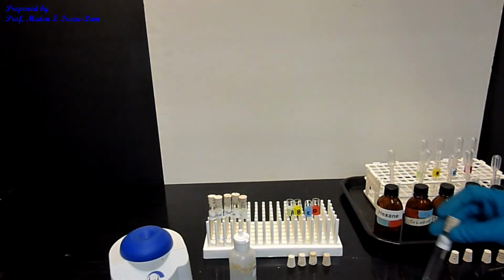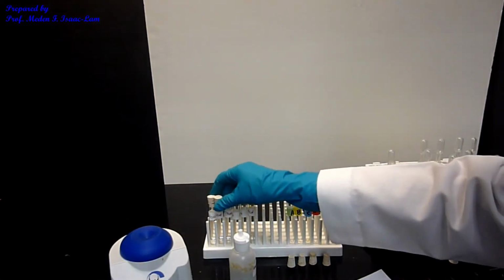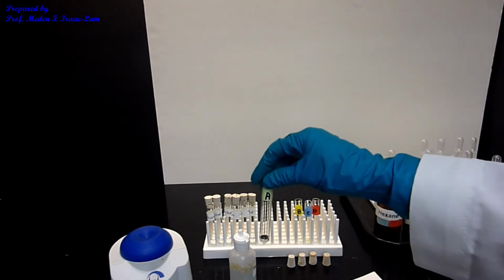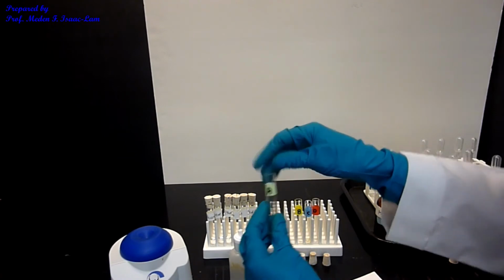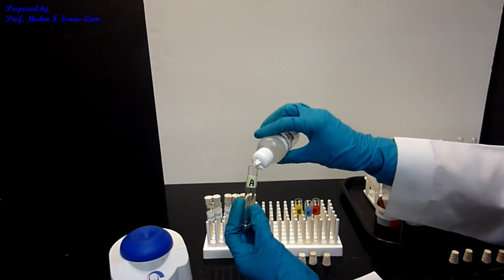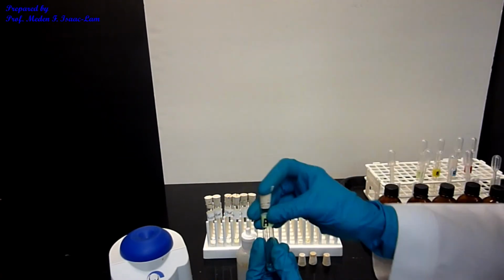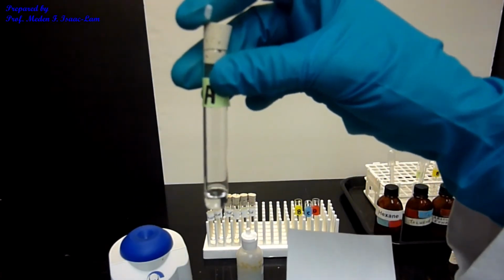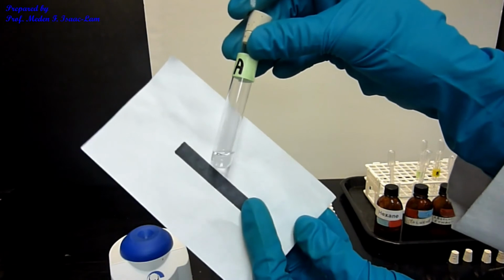Okay, it mixed well. Okay, so those are the result for the base. Now we're gonna do the same thing for the unknown, A, B, C, D. So again, 8 drops, mix it up. So this one is miscible.